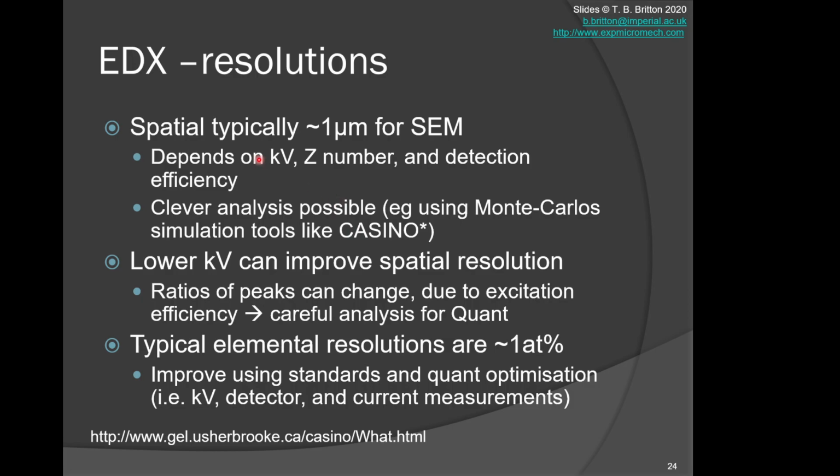The EDX spatial resolution is typically limited due to the scattering volume, and it's typically around 1 micrometer for SEM. But of course, as we can see, it depends on the kV of the beam, the Z number, and the detection efficiency. Clever analysis can be done if you use something like a simulation, like Monte Carlo, to effectively check and understand the details of when you might worry about these problems.